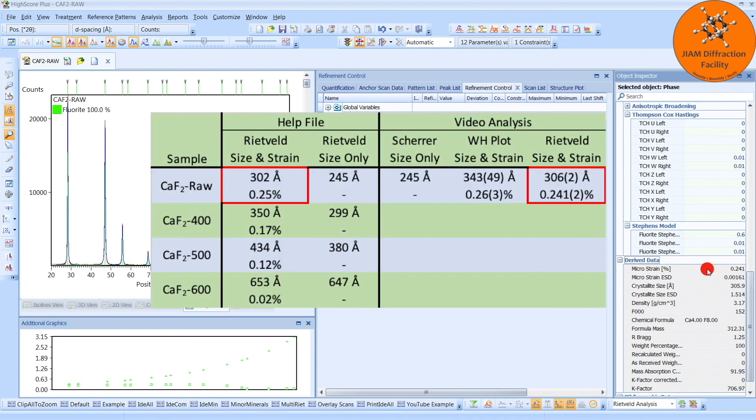What we see here is a summary of results. The first column contains the sample names, the second and third columns contain some of the results provided in the HighScore help file, and the last three columns contain the results from our series of videos.